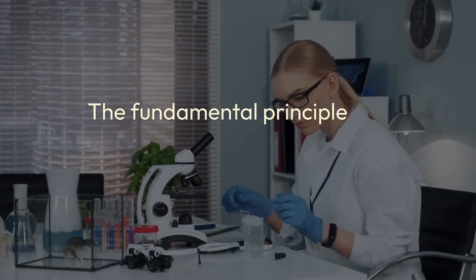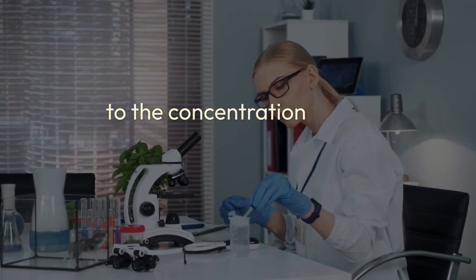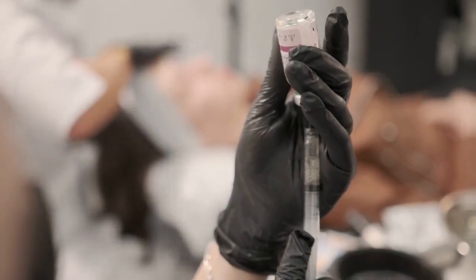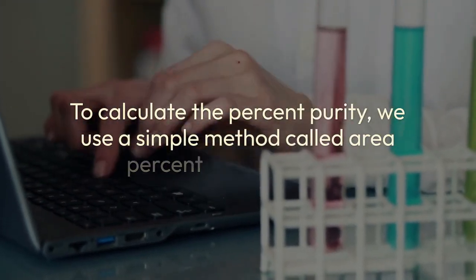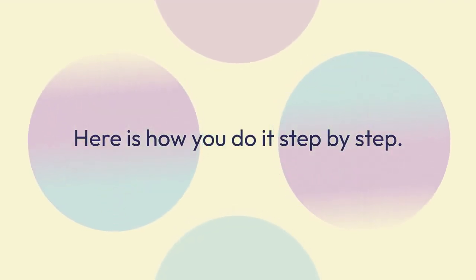The fundamental principle you need to understand is that the area of a peak is directly proportional to the concentration of the compound that created it. A bigger peak area means there is more of that substance. To calculate the percent purity, we use a simple method called area percent normalization. Here is how you do it step by step.